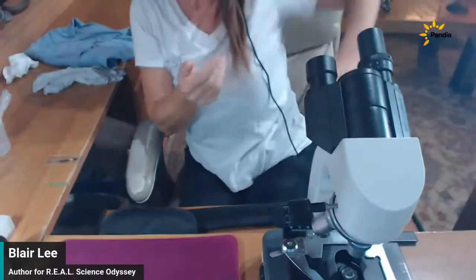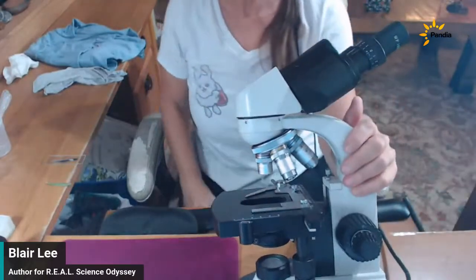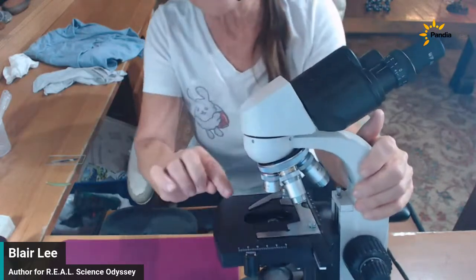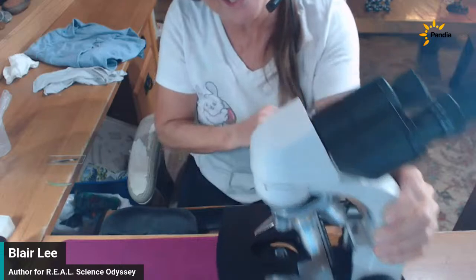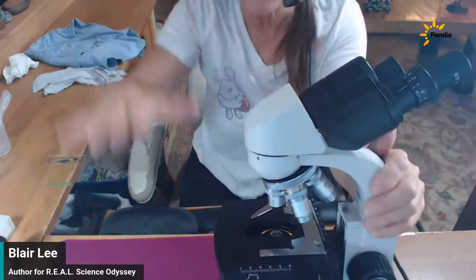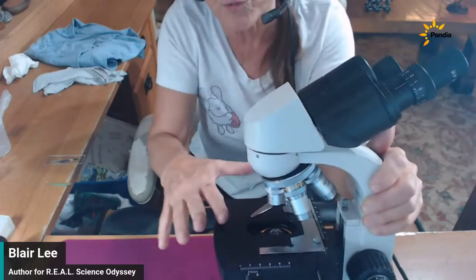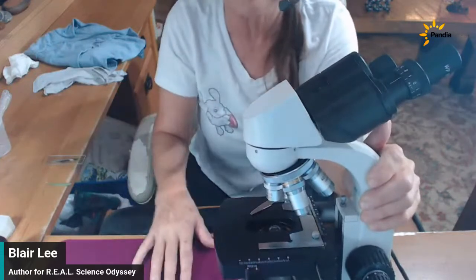Those are the supplies you'll need — plus the microscope. Now, what objective lens do I have pointing at the stage? We have the 4x shortest objective pointing at the stage, and the stage is lowered as far down as possible — as far away from the objective lens as I can get it. That maximizes the amount of room I have when putting slides on and taking them off. This is just good microscope procedure.